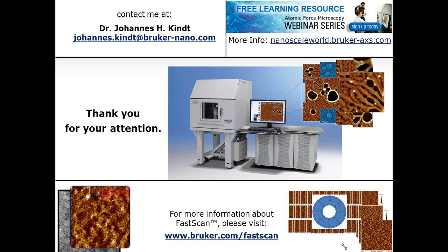So fundamentally, the way Scan Assist works as compared to other imaging modes, Scan Assist is a feature that uses the peak force tapping mode. And the peak force tapping mode is different from contact mode imaging or tapping mode imaging. In contact mode imaging, the cantilever is in constant contact with the sample and basically slides over the surface of the sample. In tapping mode, the cantilever is freely oscillating at its resonance frequency, and what is measured to follow the surface is actually the dampening effect of the surface onto the cantilever.